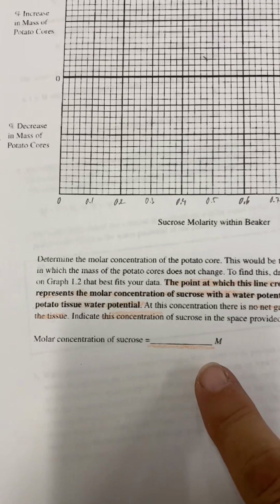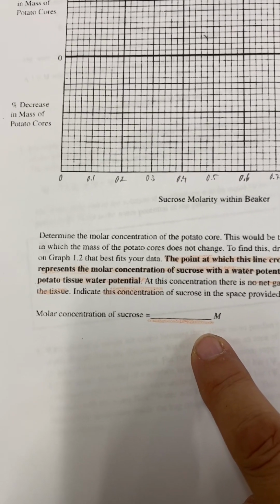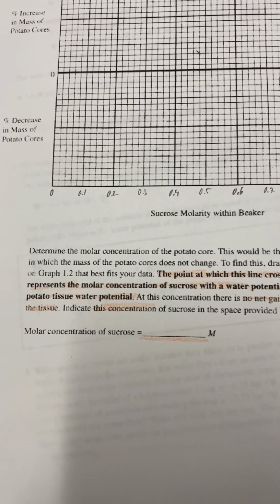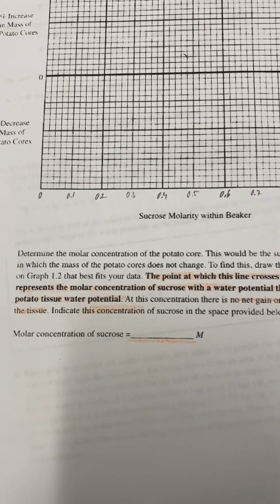So once you have this number, please write it underneath on that small line where it's asking for that value. This is the line I'm talking about. It's asking you for the molar concentration of sucrose right here, and that is the concentration that is the same that the potato has on the inside also, where there is no net gain or loss of water.